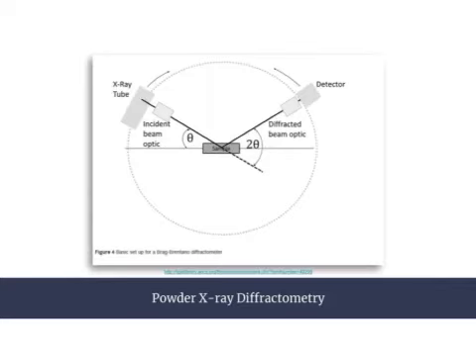As I mentioned before, the detector can also be called a reader. Kind of depends on what you're looking at. I've seen it both ways. This detector also moves back and forth on a similar path, and that's just so that it can pick up all of the different beams that are emitted off of it. Now, the detector then takes all of this into account and gives us a different reading for each of the samples that we're looking at.